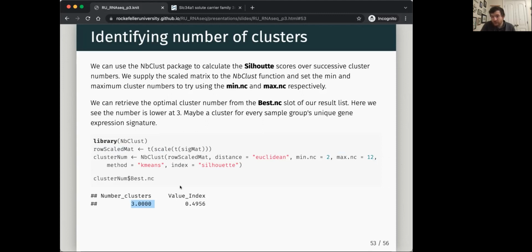It's good, but depending on how deep into the patterns you want to understand in your data, 3 might not be enough. This is why I think it's always good to assess your data, but you don't always have to live by what it says when it says 3 clusters, because you might be interested in some other deeper clusters.